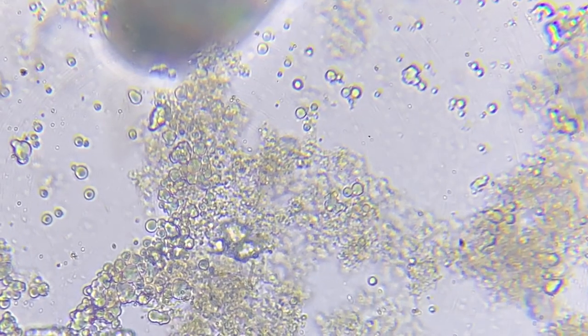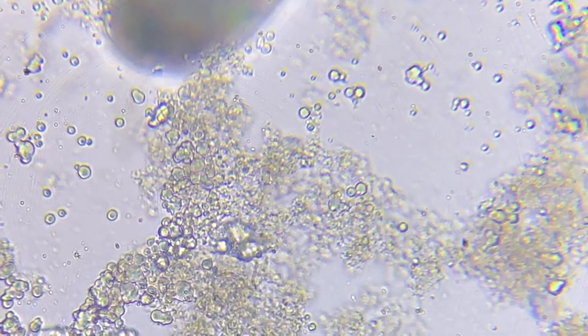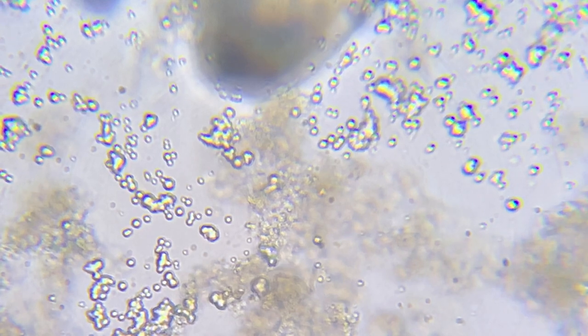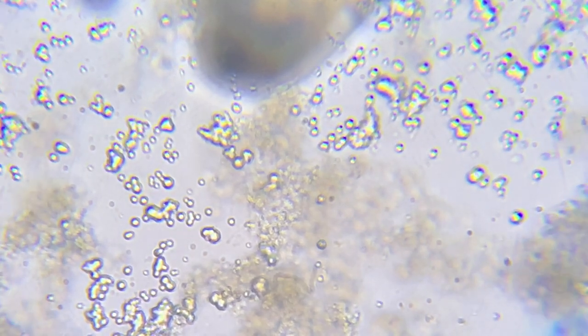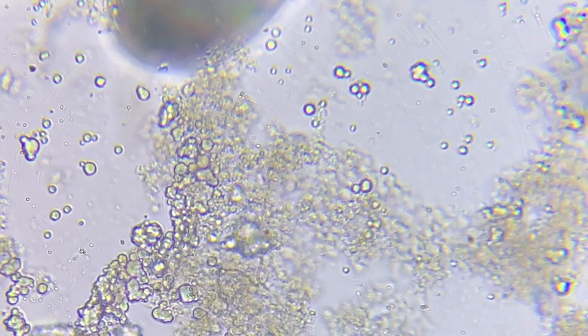This is some yogurt bacteria from yogurt with live active cultures, and I'm looking with my camera through the microscope lens. You can see it much clearer if you're just looking through the lens, but I did think it's cool how you can see the bacteria moving around and I wanted to show you this.